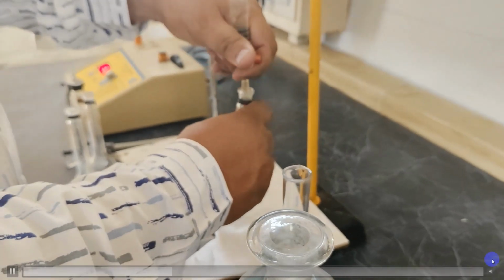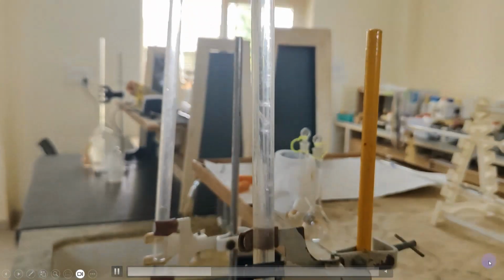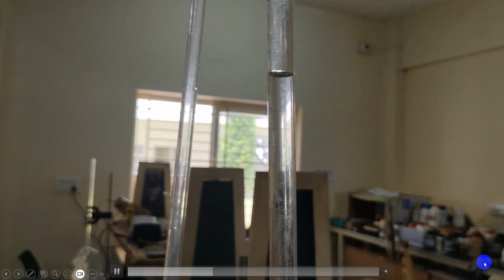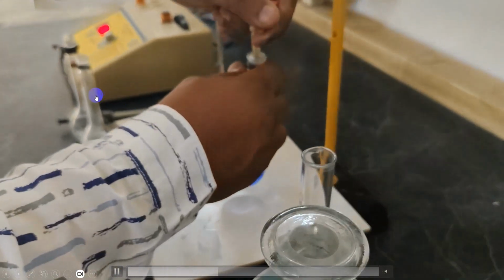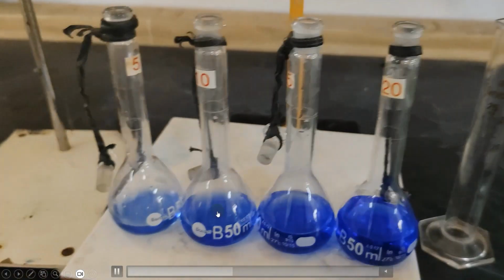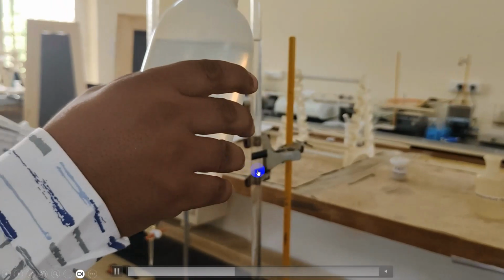Now to each standard flask add 5 cm cube of ammonium hydroxide solution. This ammonia reacts with copper sulfate, forming cuprammonium sulfate, a dark blue colored complex. In the same way, fill all the remaining flasks with 5 cm cube of ammonia. So you can clearly observe the change in the color, from light to dark.